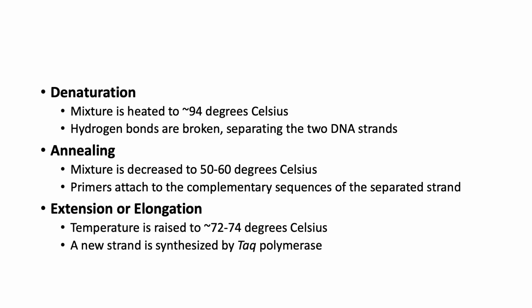The reaction is started by heating the mixture to 94 degrees Celsius. At this temperature, the hydrogen bonds that hold together the two polynucleotides of a double helix are broken and the target DNA becomes denatured into single-stranded molecules.